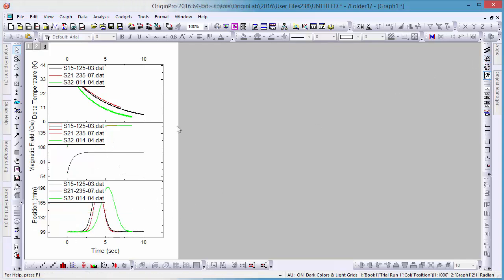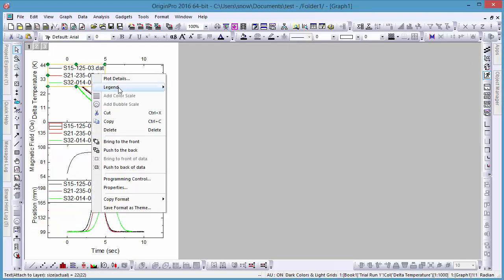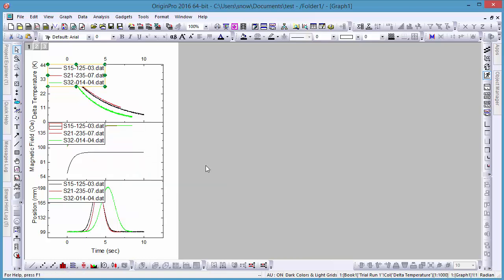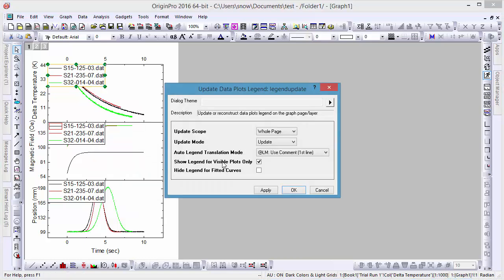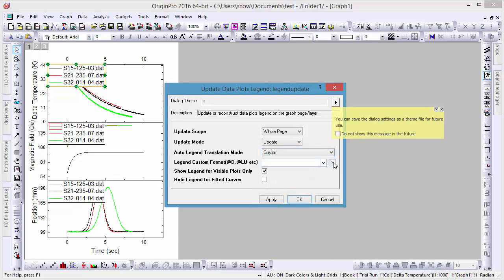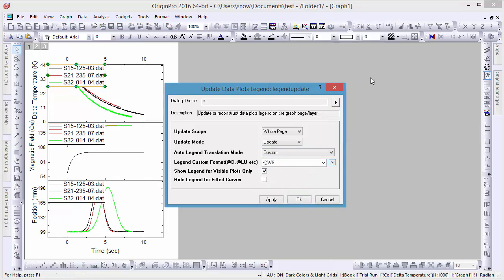To adjust our legend to our layer changes, right-click on it and select Update Legend. In the dialog, change the Auto Legend Translation mode to Custom, and then in the Custom Format menu, set the legend form to show the sheet display name.